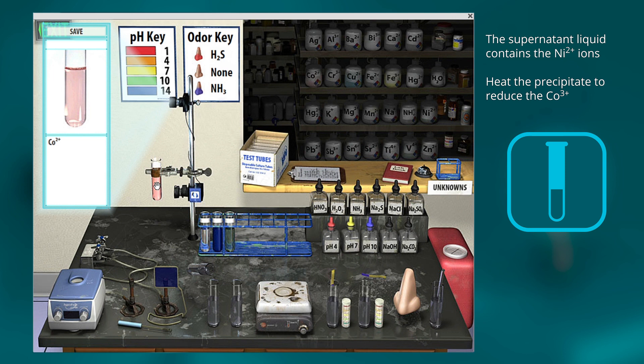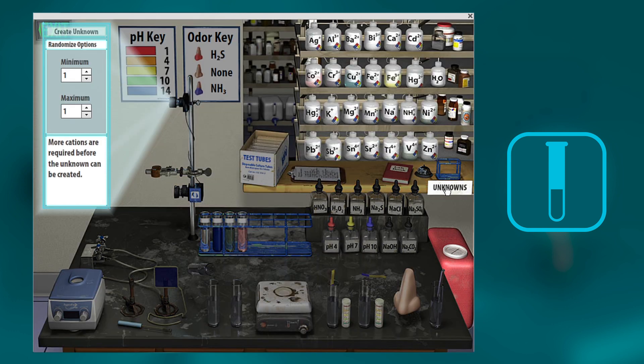So that's how you separate them. So now let's test that. If you go into the lab, we will just put it here, and you say you want to create an unknown.